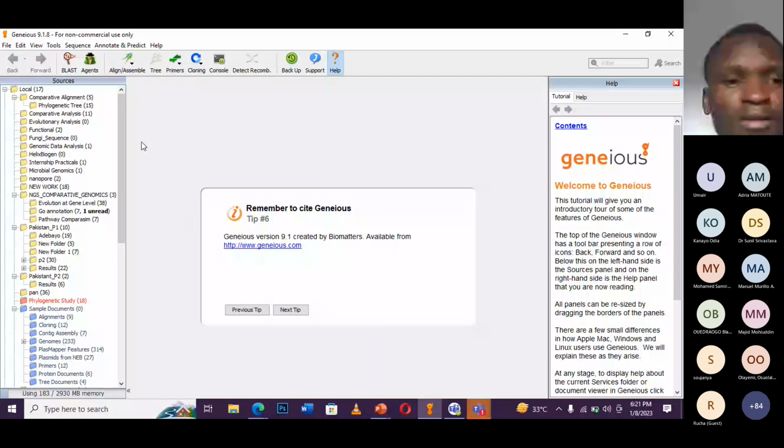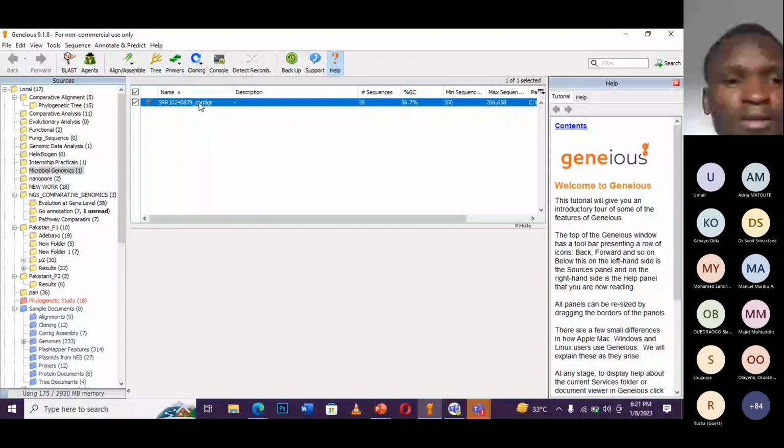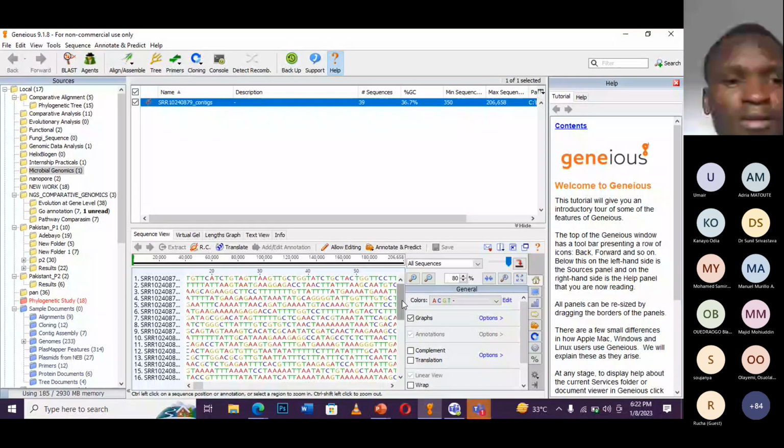So, like I said, for instance, if you want to do microbial analysis on this particular metagenomic sample, as you can see here, we have a whole lot of samples. This is a metagenomic sample, raw data that is present here. So you can do taxonomy classification with this software, like taxonomy diversity, to understand the community of microorganisms present in the metagenomic sample. So all you need to do is click the sample.